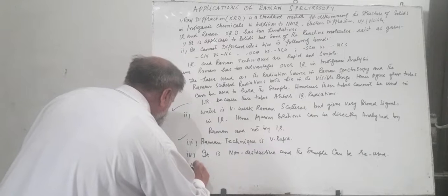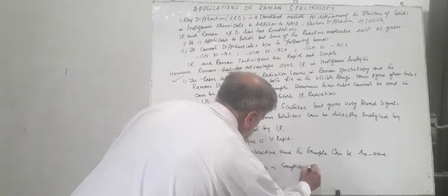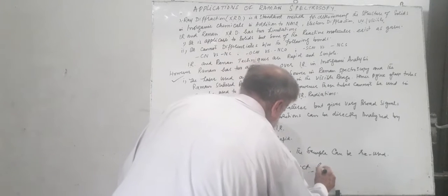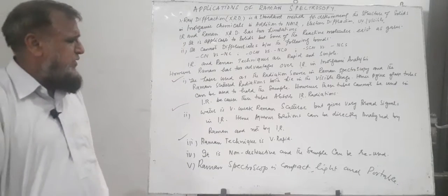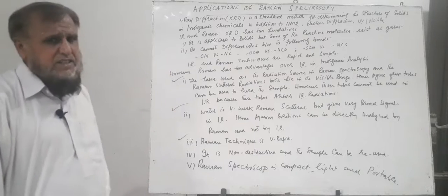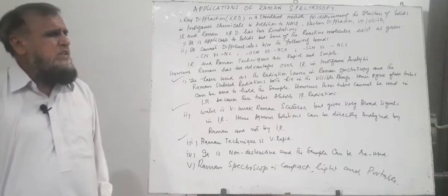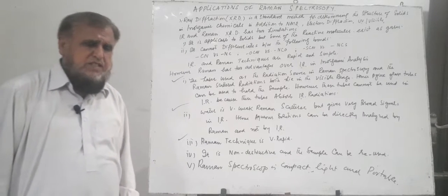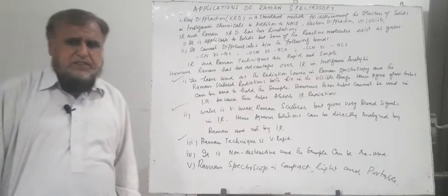And the fifth is that Raman spectroscope is compact, light and portable. So these are the advantages of Raman spectrophotometer over IR or XRD. That is why, due to these advantages, Raman spectroscopy has wide applications in many fields. Let us discuss the applications in different fields.